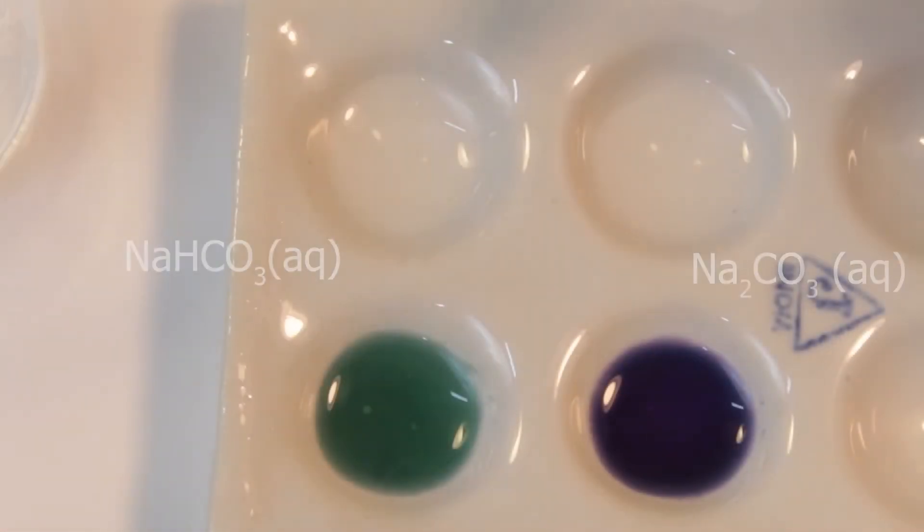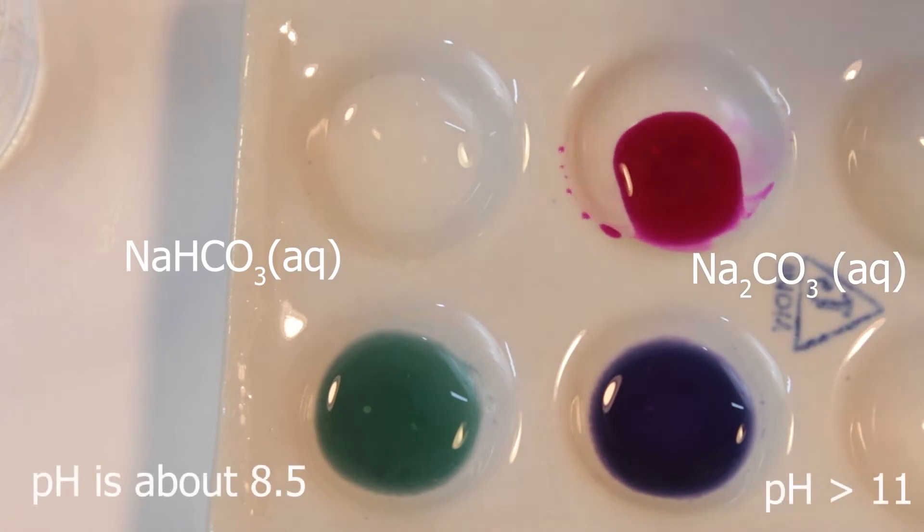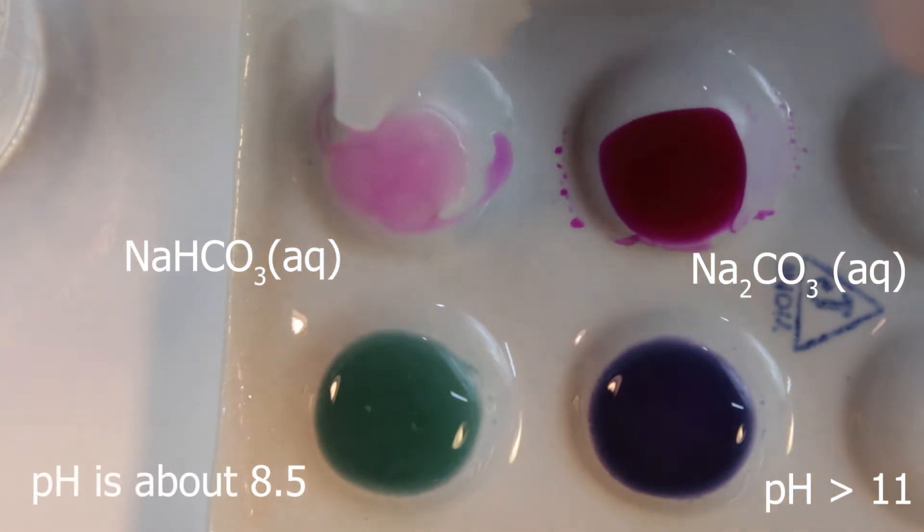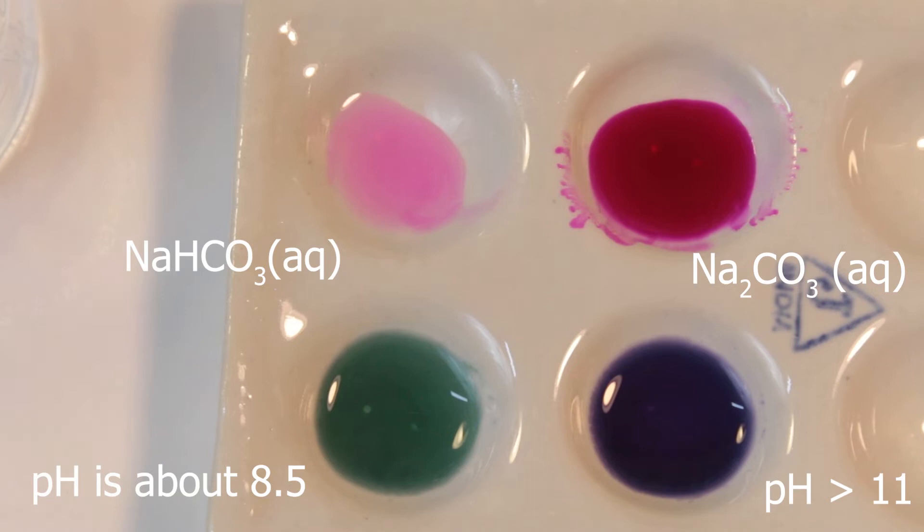Test with phenolphthalein is important for one of the tests which follows later. Hydrogen carbonate, it's pink. In carbonate, though, it's red-violet.